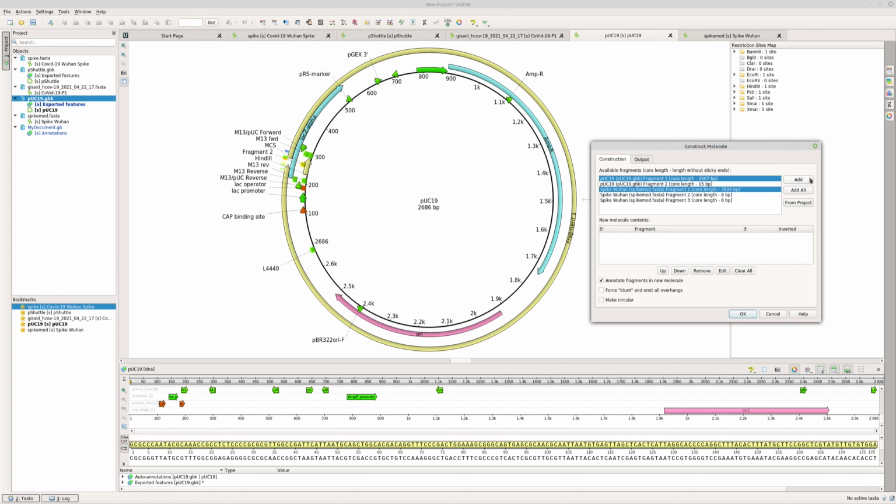So we're going to actually add these two there, right? And notice that we are using different enzymes. We didn't just use SalI. We used different ones because this way it's directional. It makes it a little bit easier for us. And that's important in any scheme, but it really depends on how you're going to do it downstream of this, if we're going to modify it in another way.